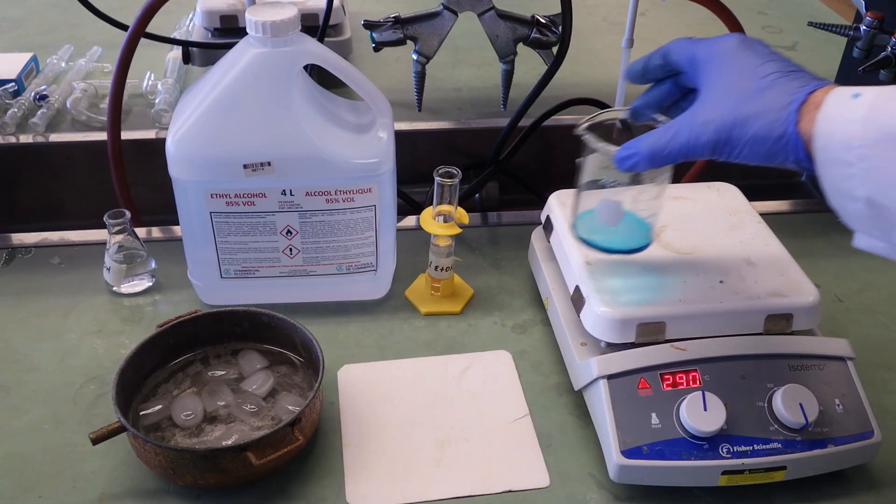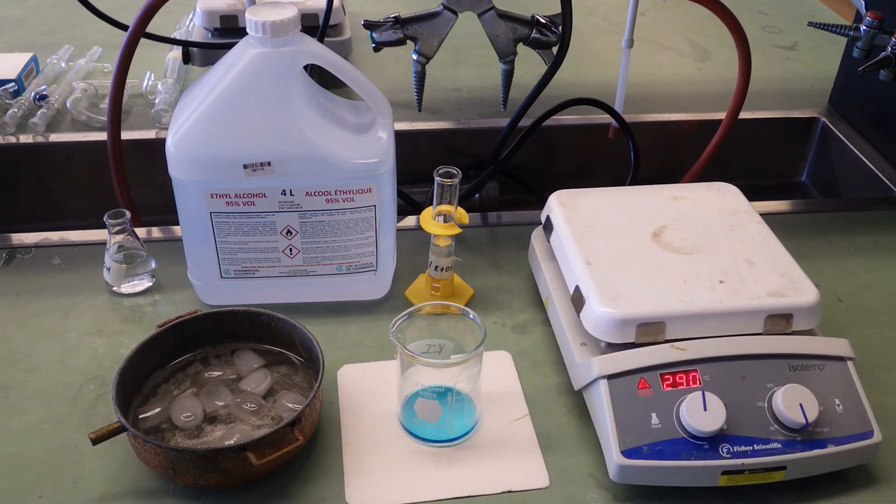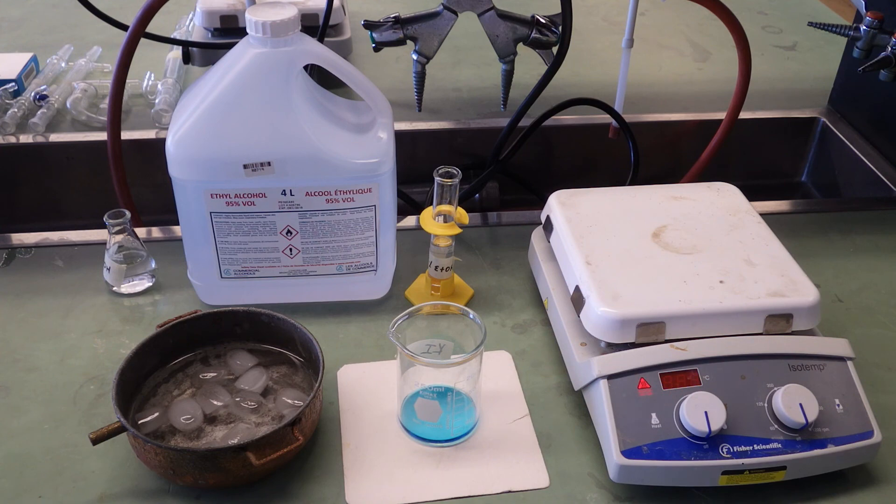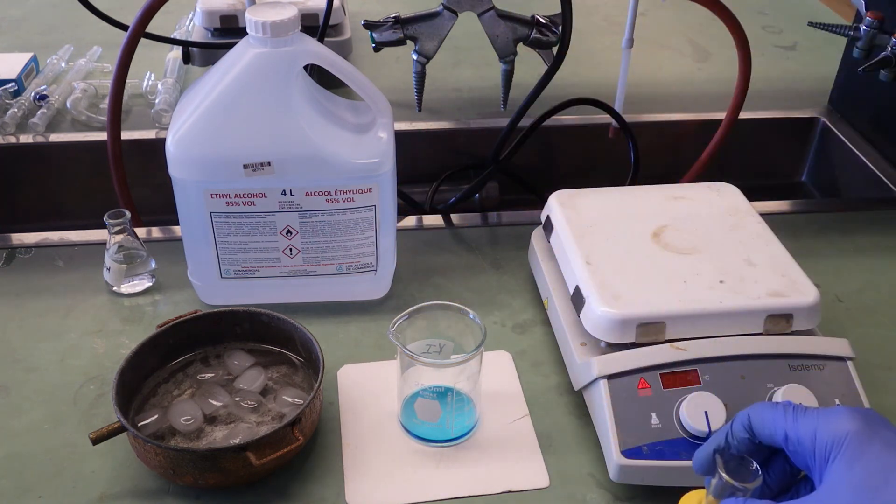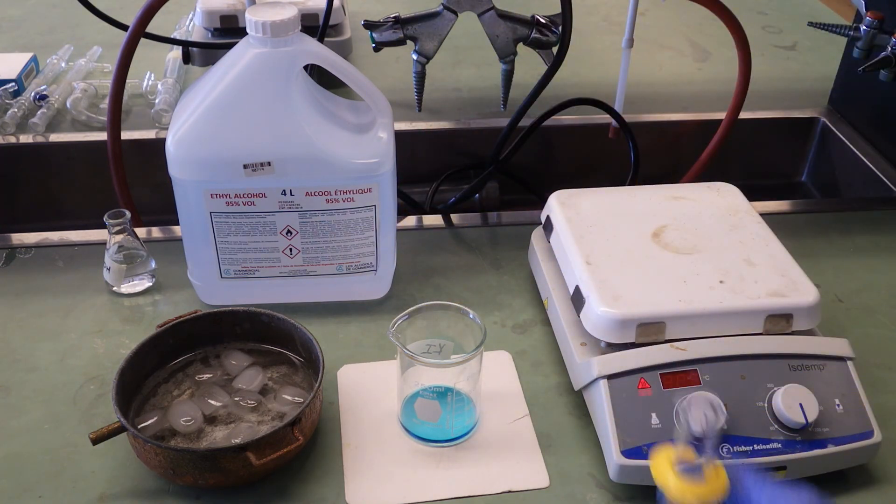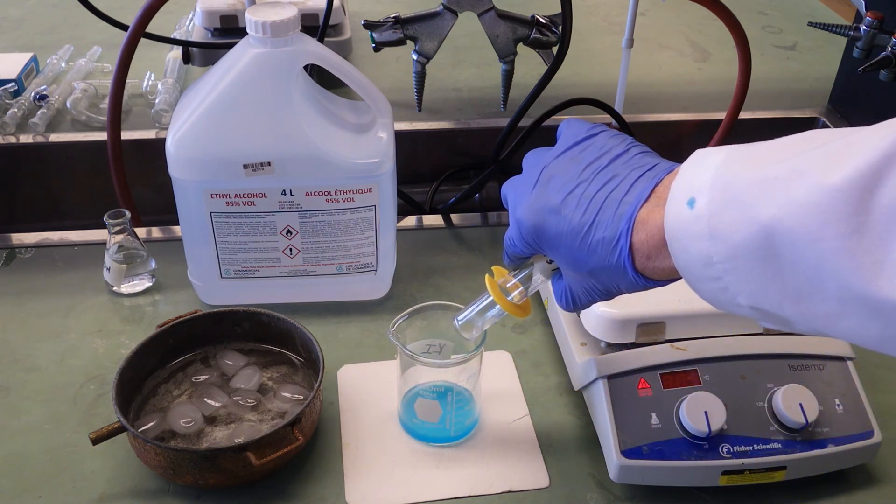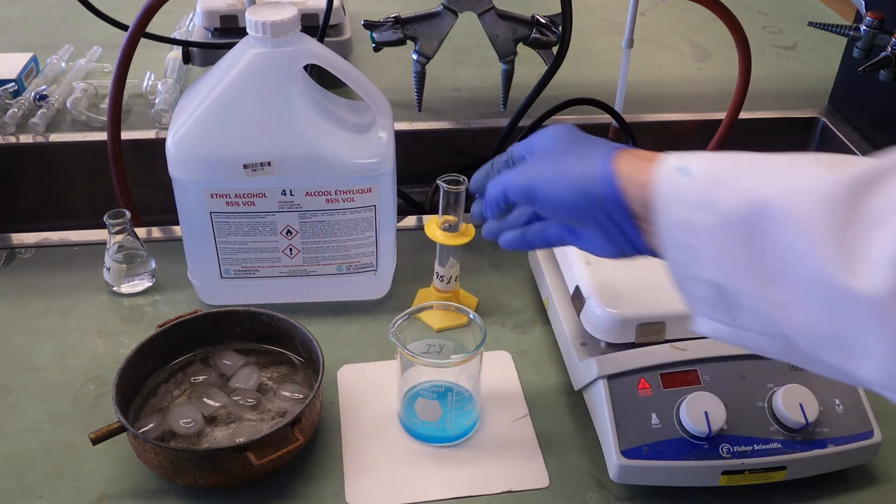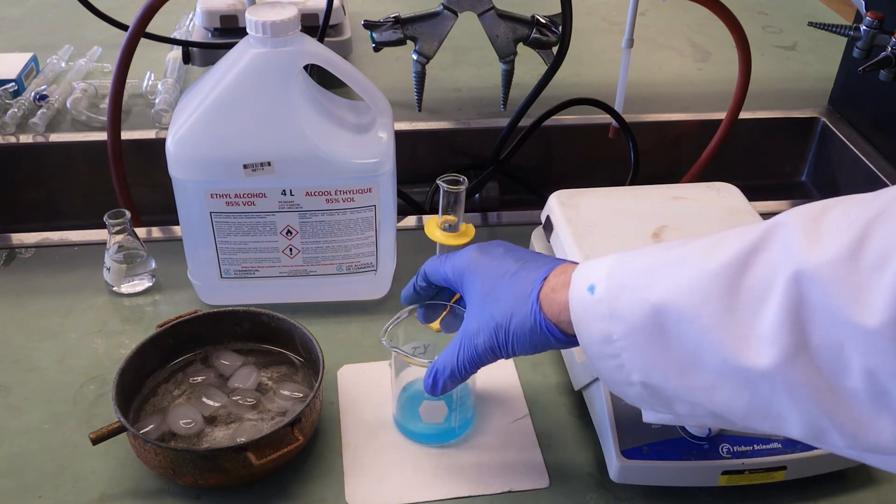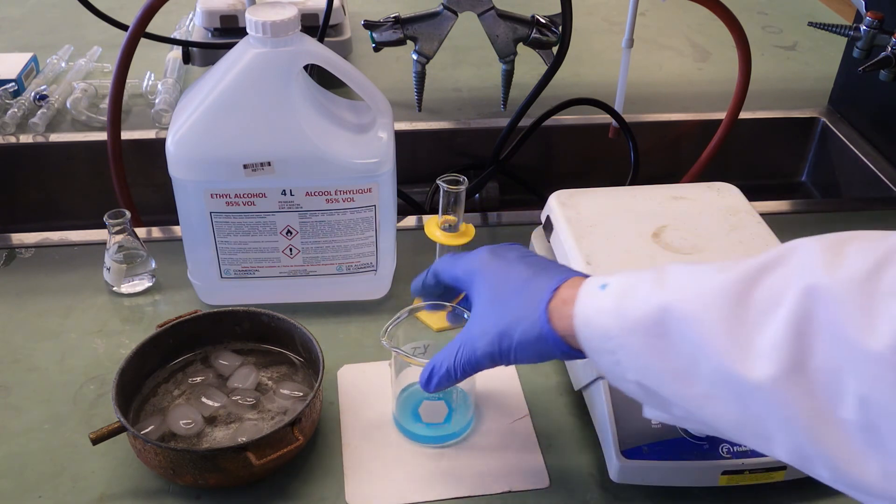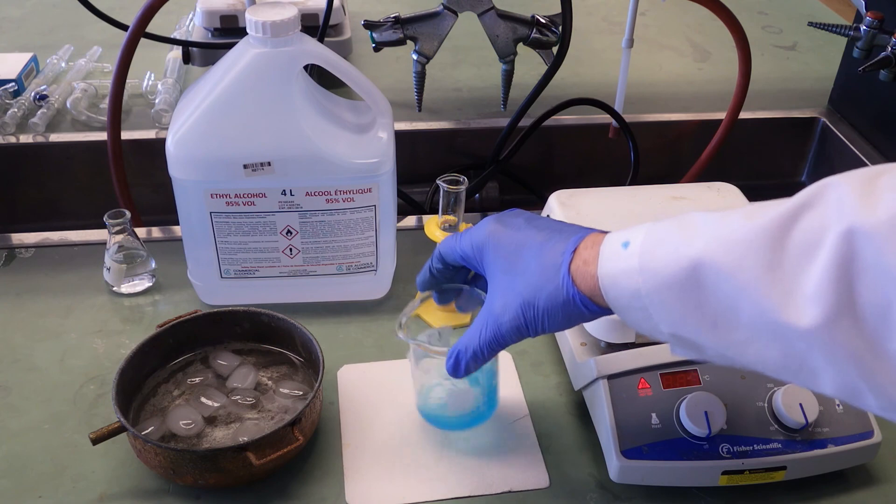So our solution has boiled down to 15 mL or less. We're now going to add 15 milliliters of ethanol. CSP has low solubility in ethanol, so it will come out of solution. We have to get it out of solution, otherwise we won't collect it.